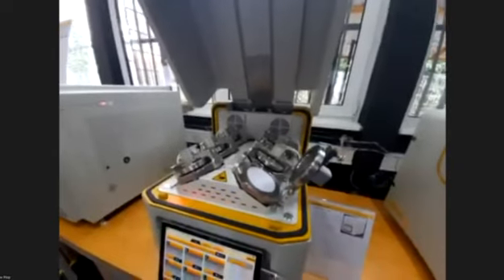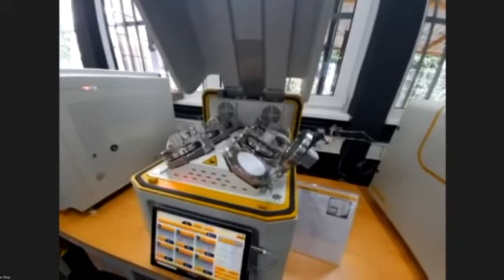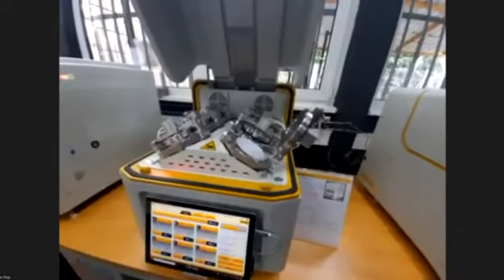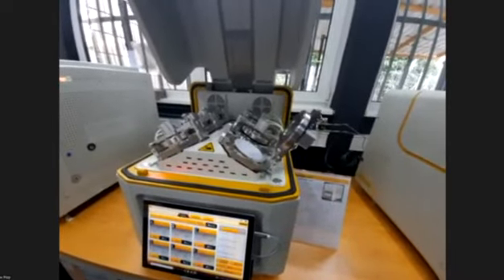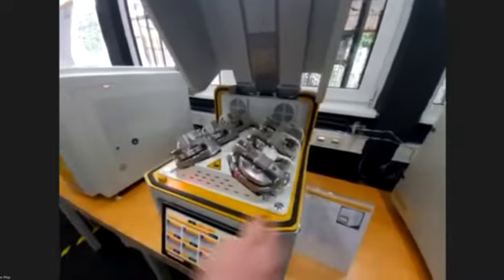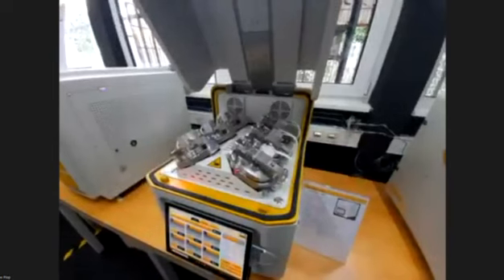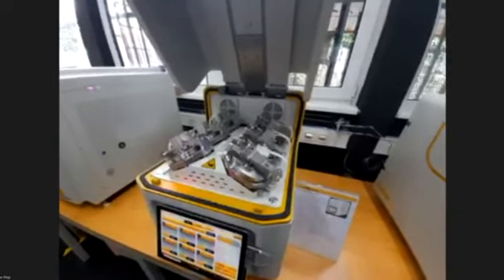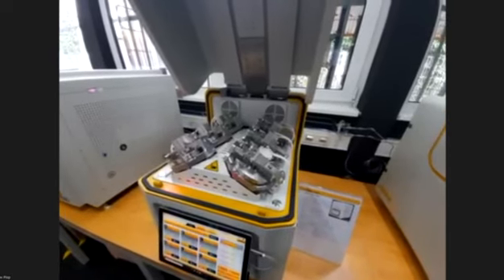So we have easy access to our samples. By pressing the button, we can open or close them. Closing the samples is done in the same manner. Also, the pressure is controlled automatically.